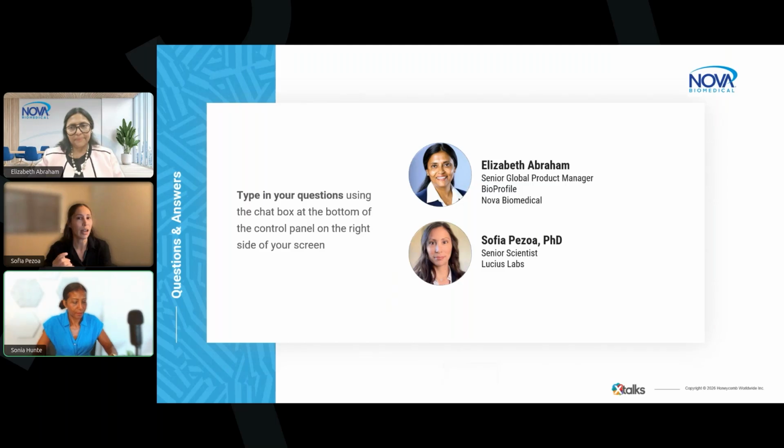Yeah, I think kind of what was highlighted in the presentation, where we're looking at fed-batch experiments, those can start at low densities and then go all the way to very high densities. So the inline dilution enables really looking at any type of experiment, whether you're working with low densities or high densities. That inline dilution option can flex between looking at something with low densities to something with high densities without having to change too much on the instrument.